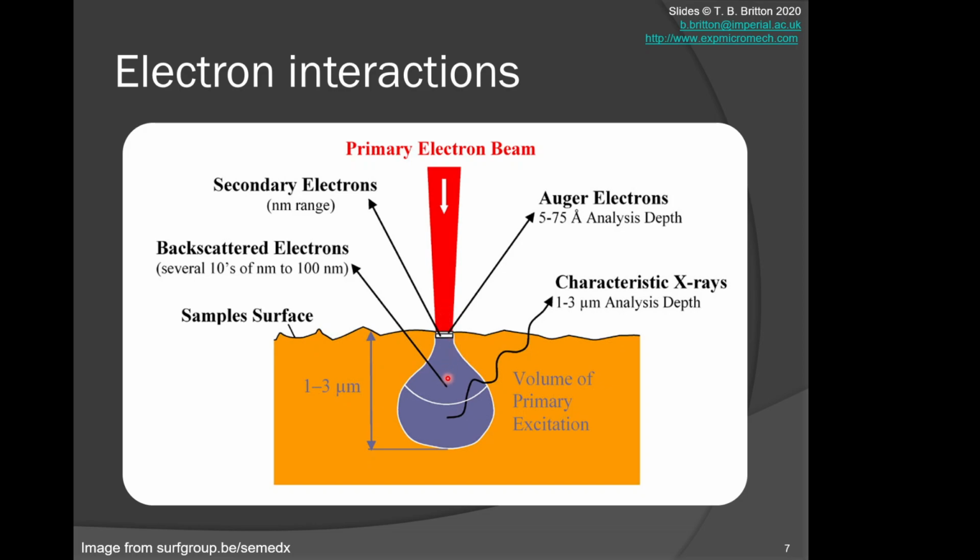In doing so, that effectively reduces the energy of the primary beam by that characteristic promotion of the core electron. And so you can only excite the characteristic X-rays depending on the Z number or the energy of the characteristic transitions in there.